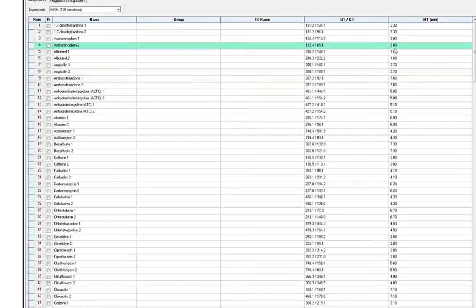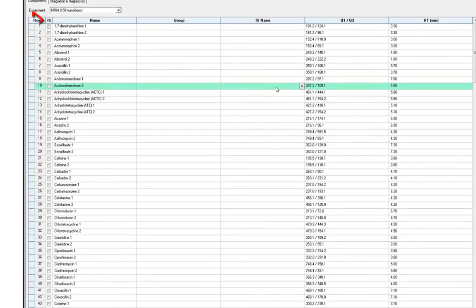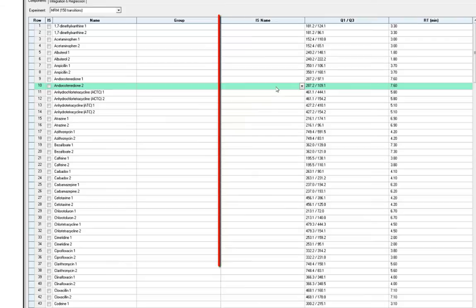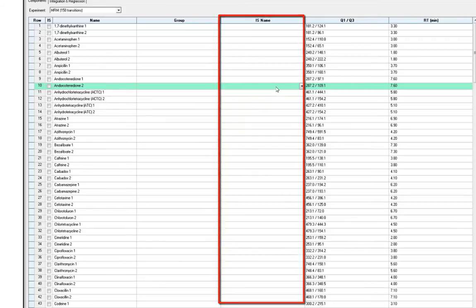If you'd like to assign an internal standard, you can also do that here by checking the IS box next to the internal standard compound, then fill that information into the IS name column.